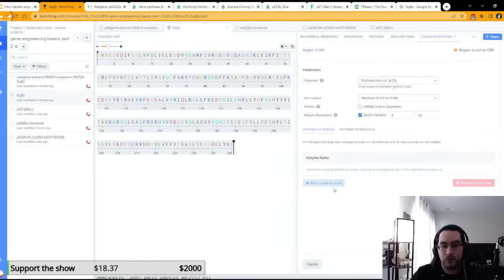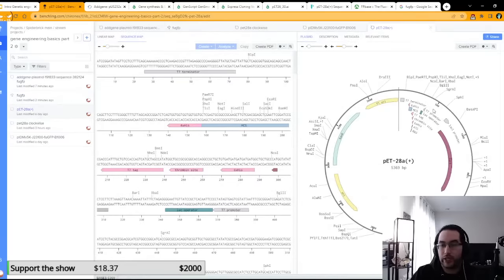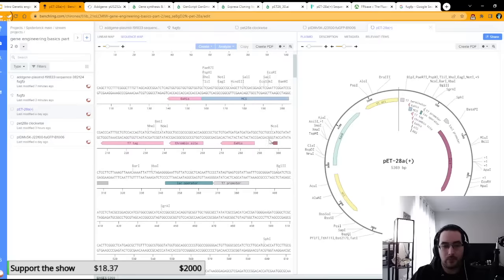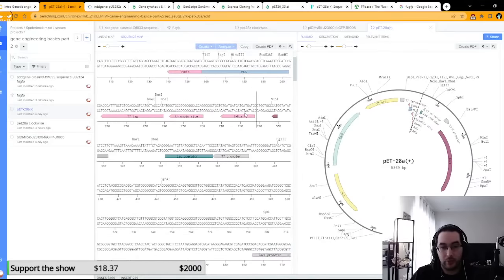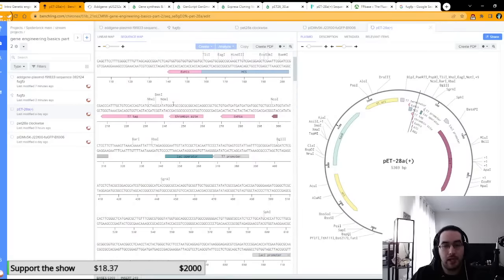So you remember we talked about restriction enzymes. So if we go to pET28, and also just so you know, this is the pET28 straight when you download it, but you'll notice that everything's pointing in the wrong direction, right? So the promoter is pointing to the left, and then you've got the protein stuff up here. This is really annoying because I hate reading it like this. It's deeply, deeply annoying. So basically all I did to fix this was I went Control A, and instead of hitting copy, I hit copy special, reverse complement.